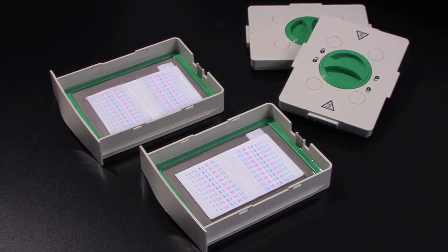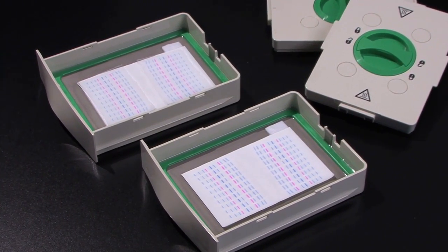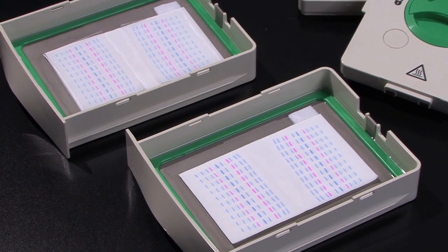In addition, you can now transfer four mini-gels simultaneously, matching the throughput of our Mini-Protein Tetra Cell.